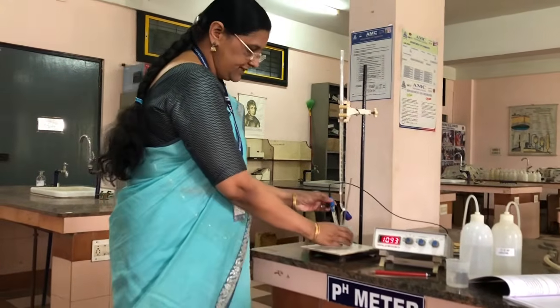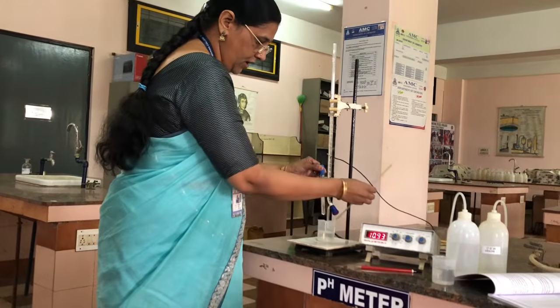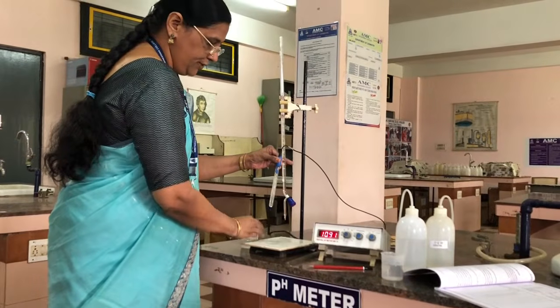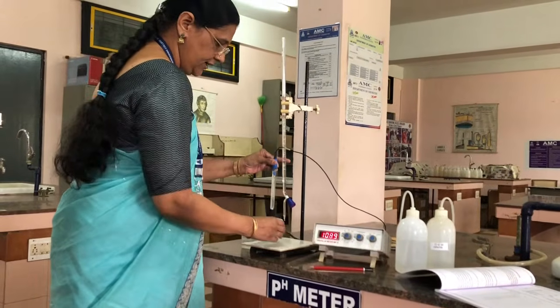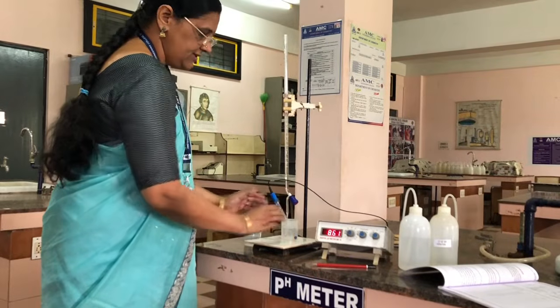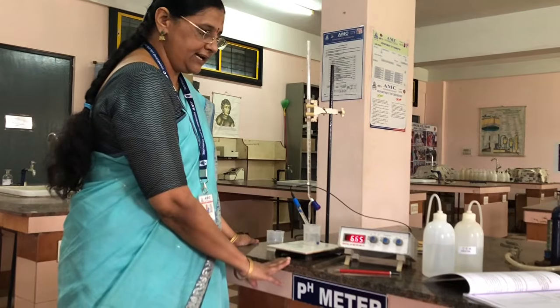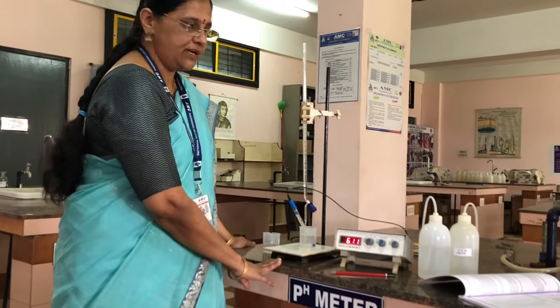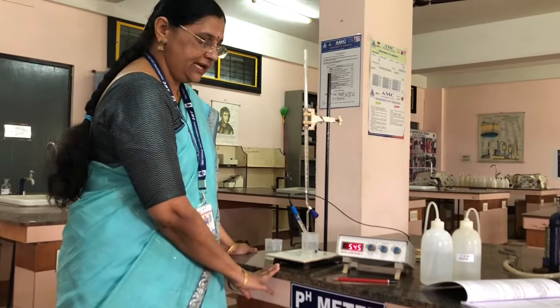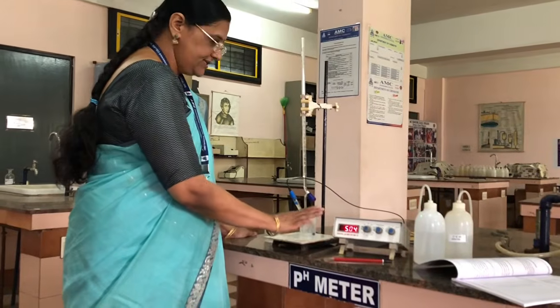So after doing the experiment, again you have to take out your glass electrode. Take out the beaker and put this glass electrode back in the distilled water very carefully, because this is a highly sensitive electrode. So this is the experiment conduction. This is the first experiment which we have done today, that is for the determination of pKa of weak acid using pH meter. Now this is the first part.